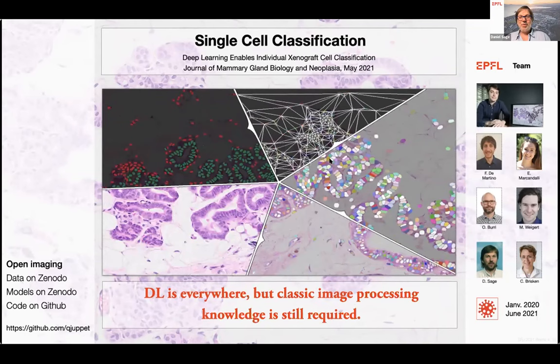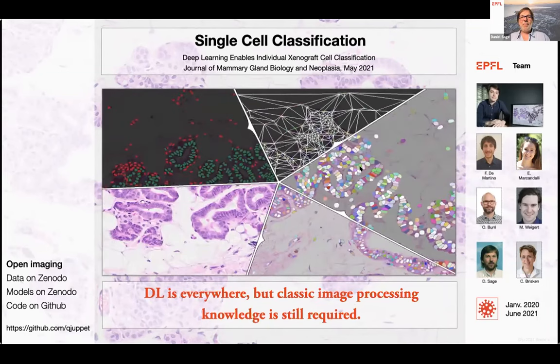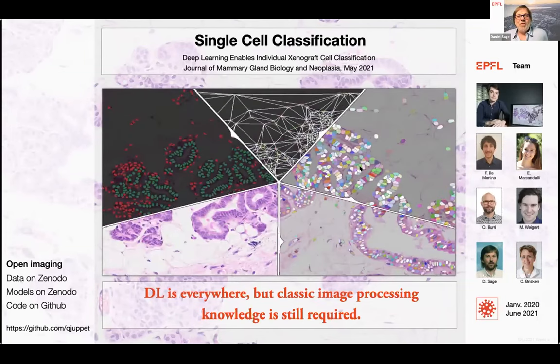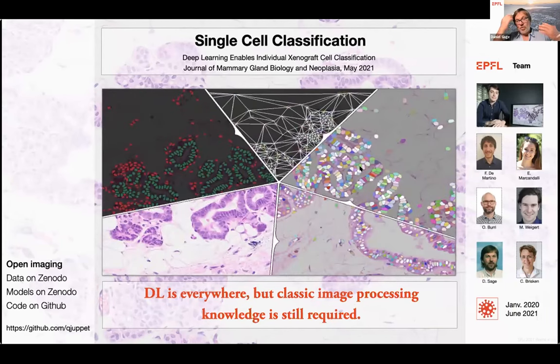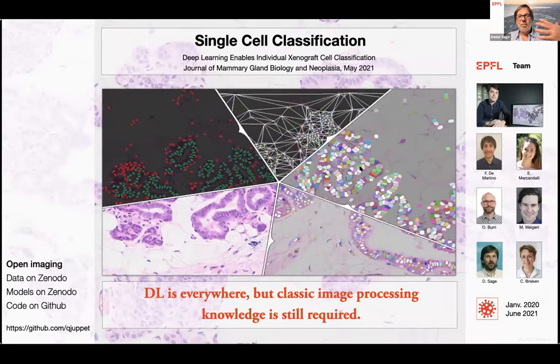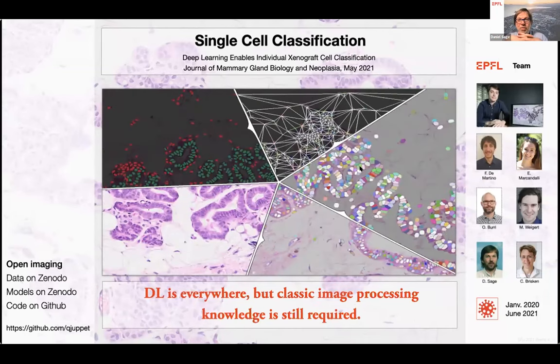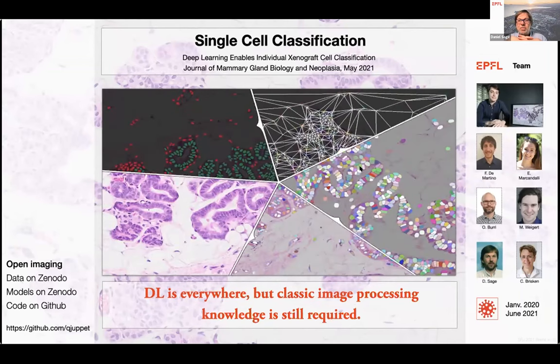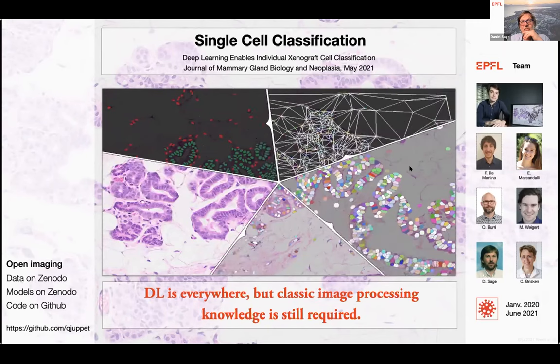Marco Salamanca asks, do you have any suggestion on how to check if the model we selected for deep learning is good enough? Okay, yes, you can have a validation step. You have to provide some clean data, ground truth data, you run some predictions, and afterwards you measure the discrepancy between your clean data and the output. It's probably a good thing to do all the time for every model. In fact, it's a good practice to validate your systems. Of course, that requires some clean data.